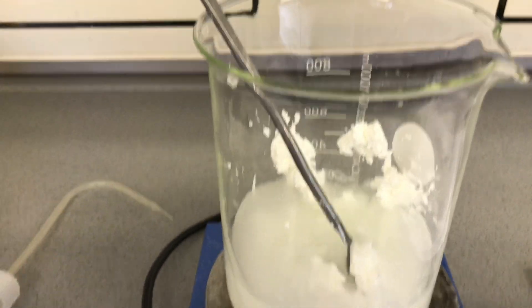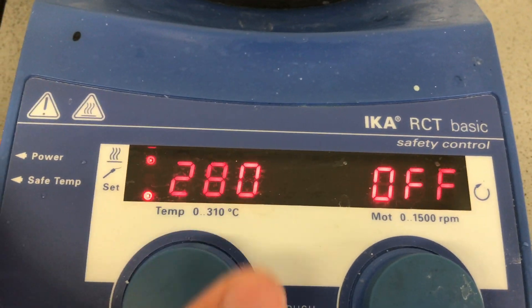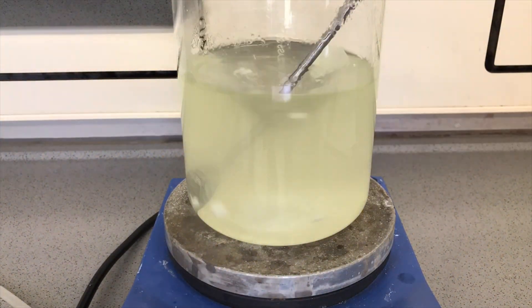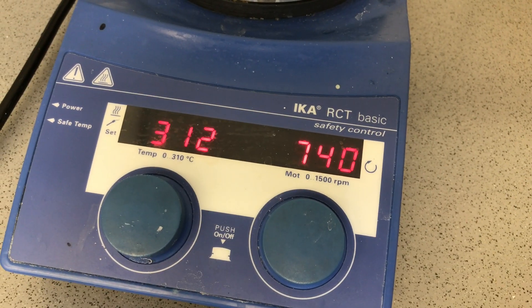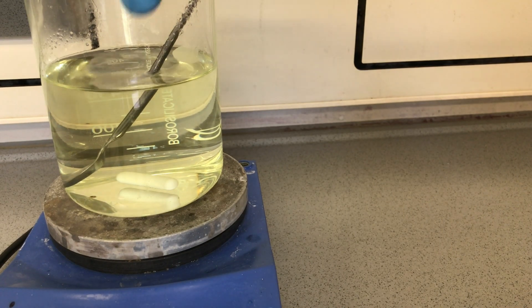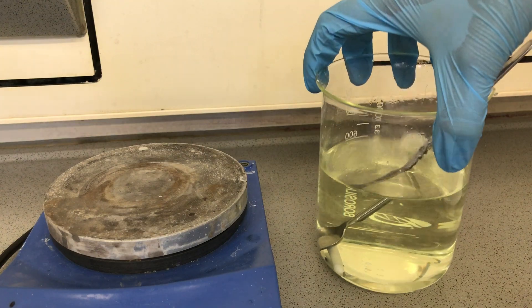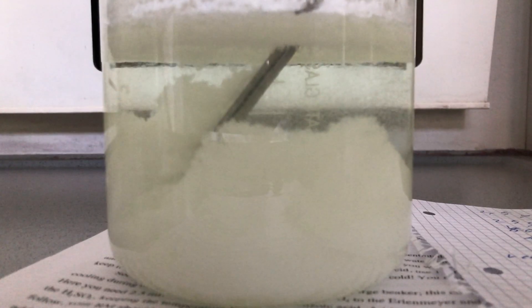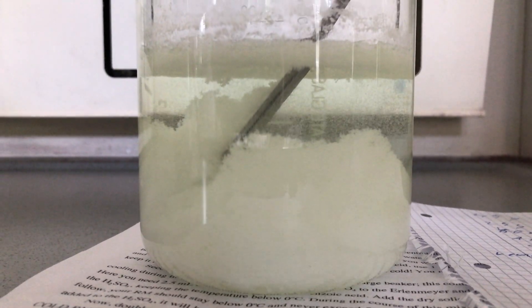A lot of distilled water was added and a recrystallization was performed. Similar to normal benzoic acid, nitrobenzoic acid poorly dissolves in cold distilled water but it easily dissolves in hot water. Once dissolved, the hot plate was turned off and the nitrobenzoic acid was allowed to crash out. It settled as a white powder, another filtration was performed, and afterwards it was dried over anhydrous calcium chloride in a vacuum desiccator.